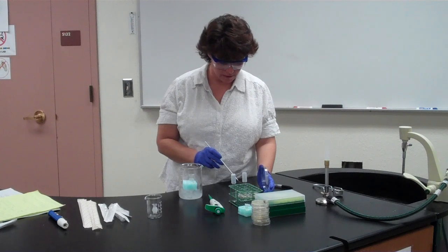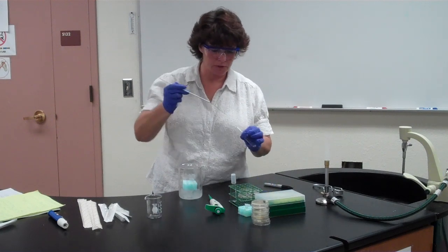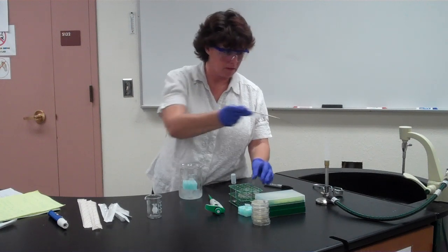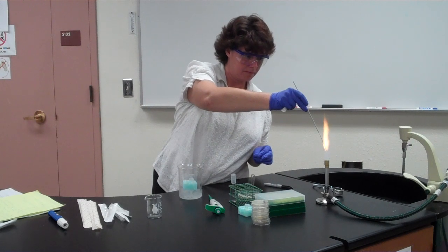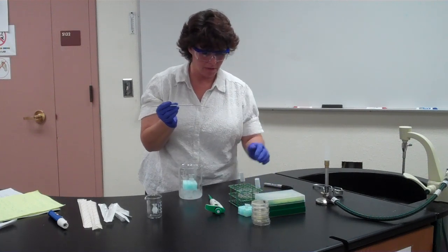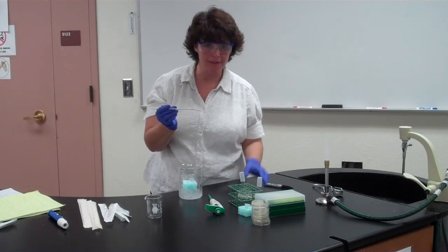We're going to take a colony. Like I said, a good sized colony, and you're going to put it in the first tube. You want to actually break it off in there. Okay, you want it to all come off. Okay, we'll flame that. And then we're going to do the same thing. You want to get basically the same amount. These two tubes need to be identical, except for adding the DNA.